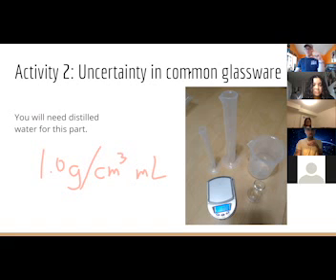So if I have 7 mils of water, I should have 7 grams. But it's not exactly 1.0. It's really close because it depends on the temperature. So the higher the temperature, the more the water molecules move apart from each other and the lower the density is. As we lower the temperature, the water molecules stop moving around quite so much and they move a little bit closer together and it gets a little more dense. Strangely though, when it freezes, they move back apart from each other and ice is less dense than water, which still seems weird to me, but it's true.